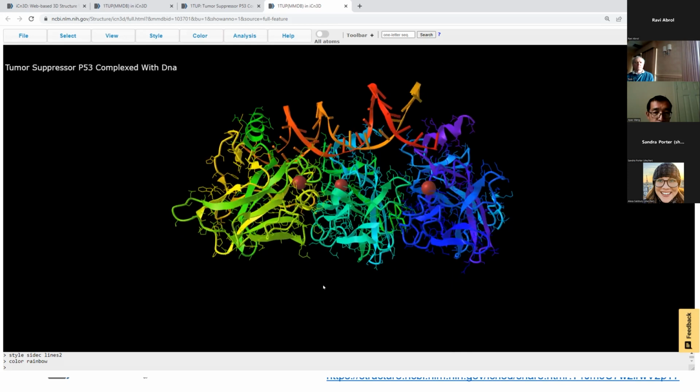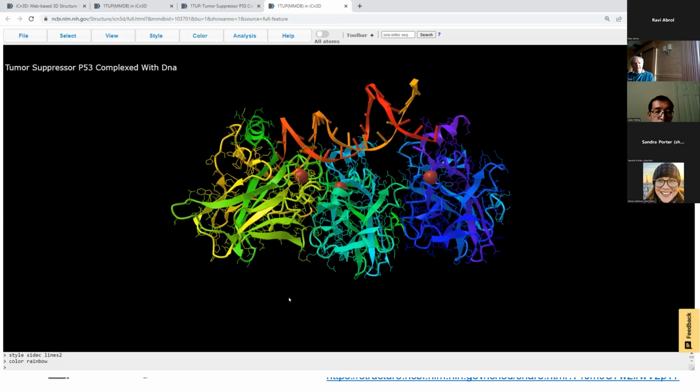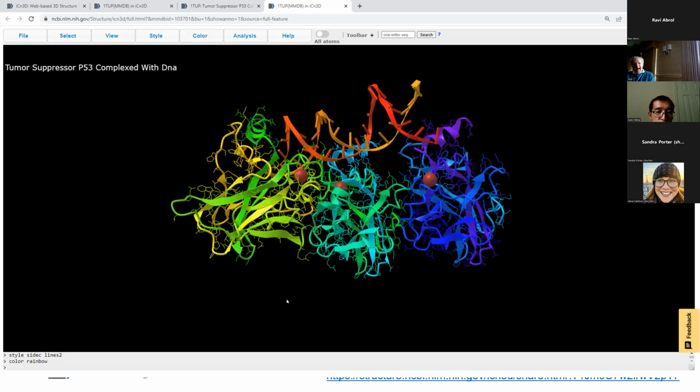And then of course it's a little bit more helpful if maybe you select different components and not a whole big structure as this color. But it's good to know how that works, because like I said, a lot of people, especially when they're new to molecular visualization, like to use rainbow. So it's good to know what's there.